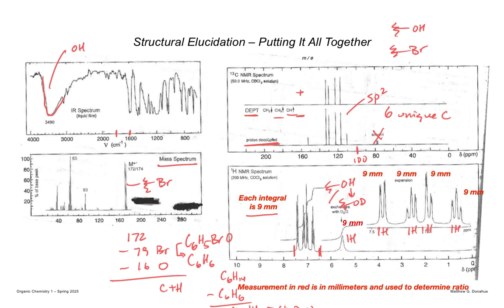I'm going to move over onto a blank slide, so we can have some room to work with here. Now look at those 4 signals that you're given. You're deciding now between the 1,2 and the 1,3. So the data matches which one of those isomers the best? The 1,2. So why is that? What's not there? A singlet. There's no singlet there, so it has to be the 1,2.